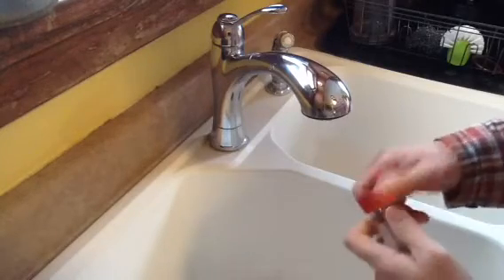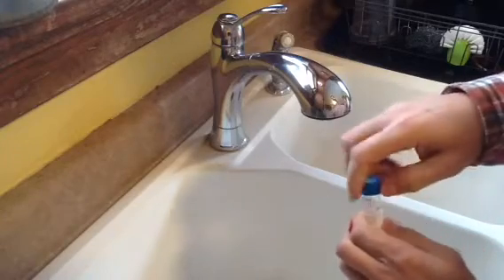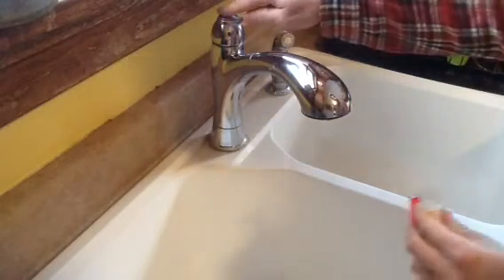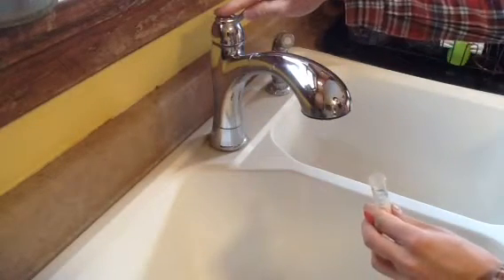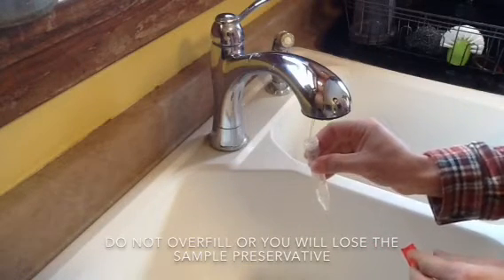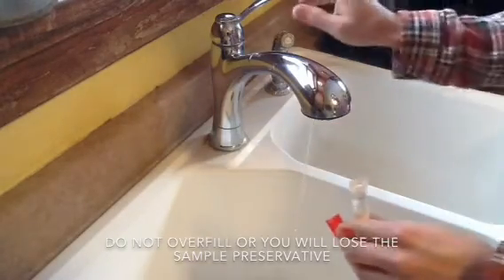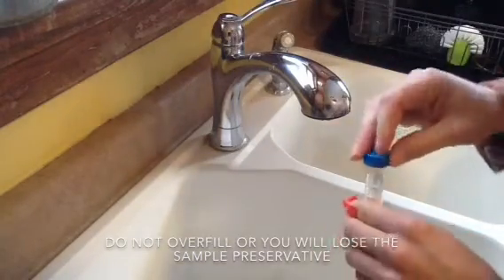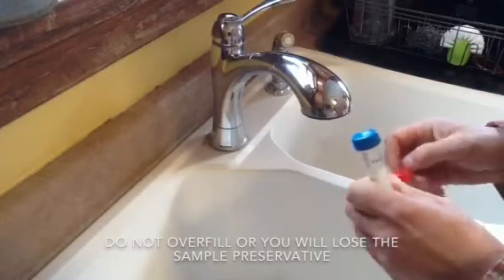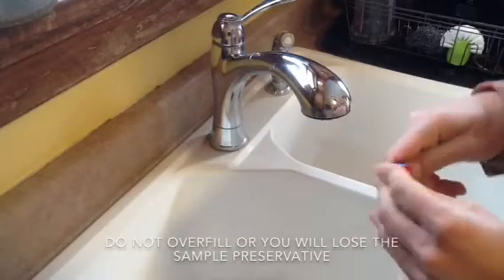When collecting the metal sample, first remove the red tape from the blue cap. Unscrew the cap and turn the faucet on so that the water comes out as a slow trickle. After a couple seconds, place the vial underneath the stream of water and fill to within about a 1/4 inch of the top of the vial. You want to take care not to overfill or you'll lose the acid preservative. Once you're done, replace the cap and replace the red tape around the cover.